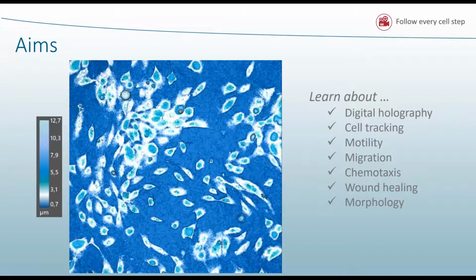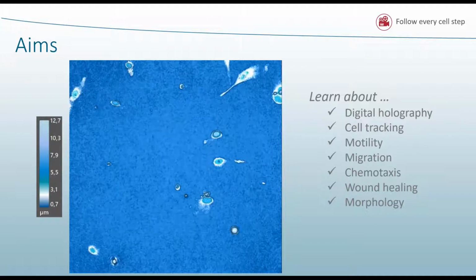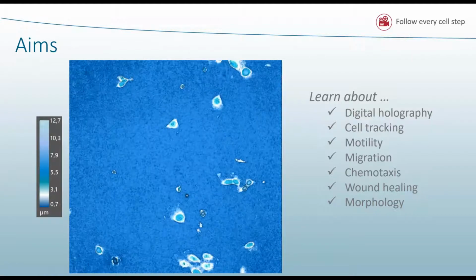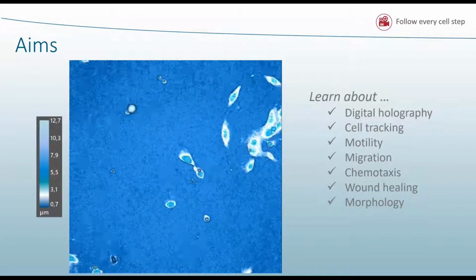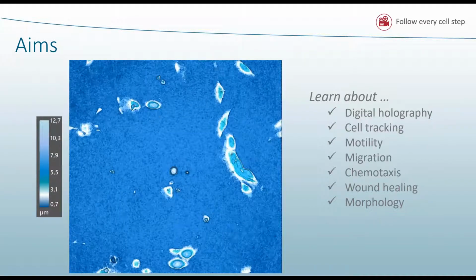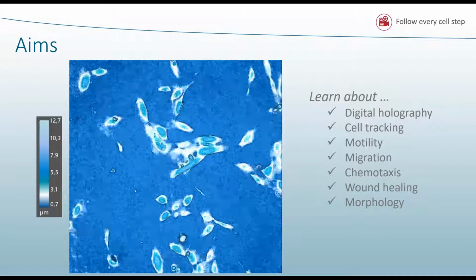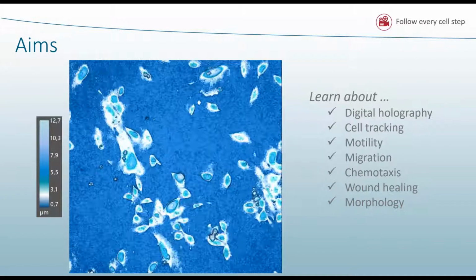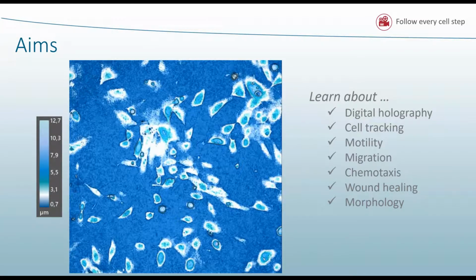All the studies that I present here are based on digital holographic microscopy. I will talk about how to track the cells and the difference between cell motility and cell migration, and how to look at chemotaxis, how to use wound healing. And in addition, we offer that you get the cell morphology together with the cell movement.